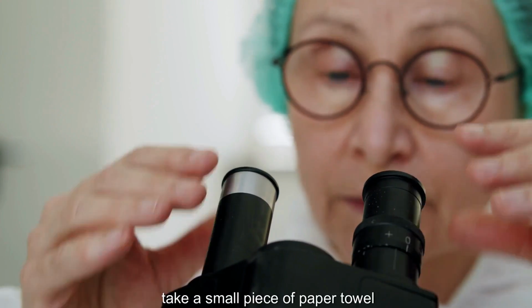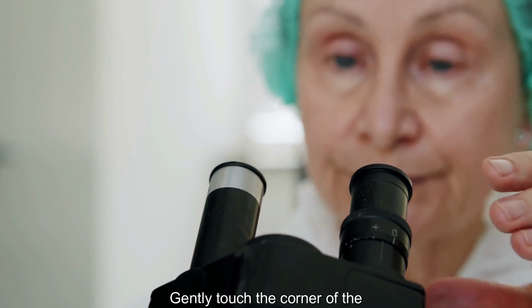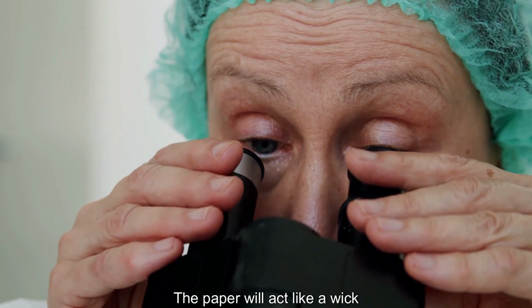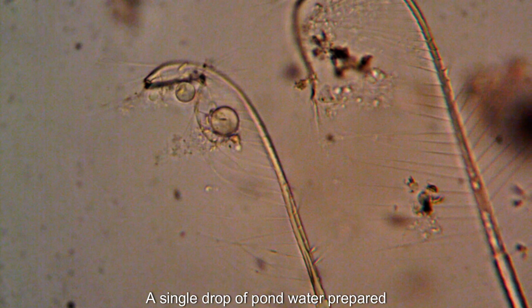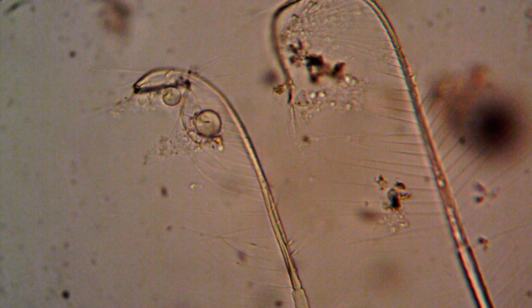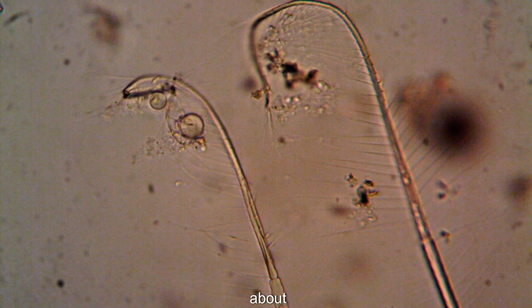To clean this up, take a small piece of paper towel or tissue. Gently touch the corner of the paper to the edge of the cover slip. The paper will act like a wick, drawing the excess water away. A single drop of pond water prepared in this way can reveal a bustling community of life. You might see tiny, slipper-shaped paramecia darting about.